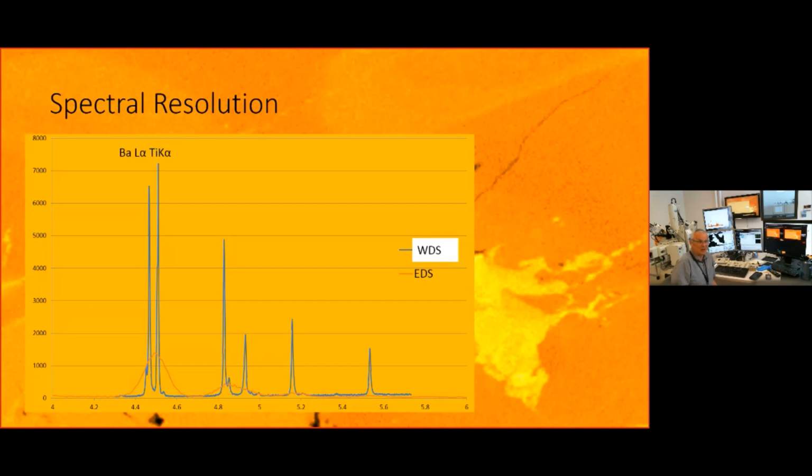If I really, really work hard at looking at things like, there's a thermometer, one of the students here used the amount of titanium in quartz. And very special, I don't think I'll ever do it again, but you can go down to 7 parts per million titanium in quartz. I didn't believe it myself, but I could reliably do it, and I can measure 0 in my blank. So I am getting down to about 10, 15 parts per million titanium in quartz. That's really pushing it, and that took more preparation time than the actual analysis time.